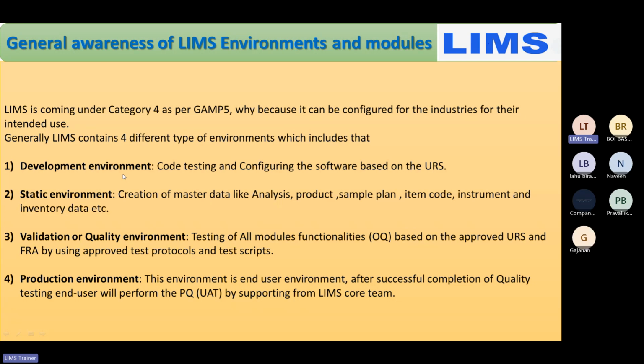After this comes the validation or quality environment. Here, whatever software is developed by the IT industry and whatever static data is created by the laboratory will all be validated. It will be checked in the validation or quality environment. There will be some module functionalities, like operational qualification, based on the user requirements. This is how it will be validated in the quality environment.